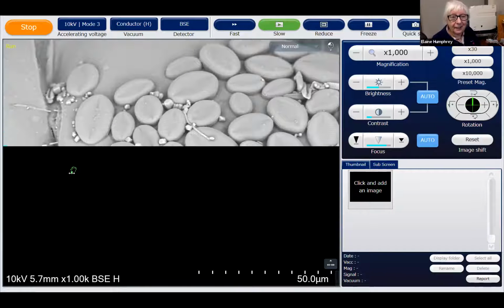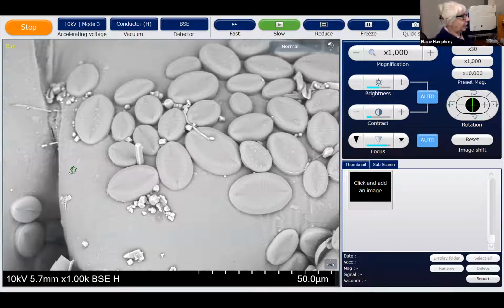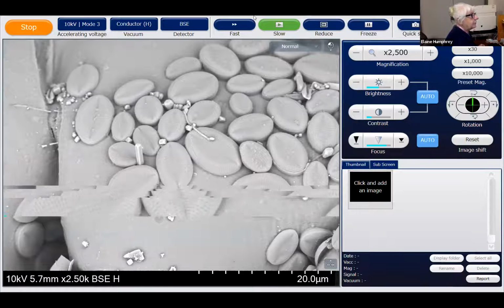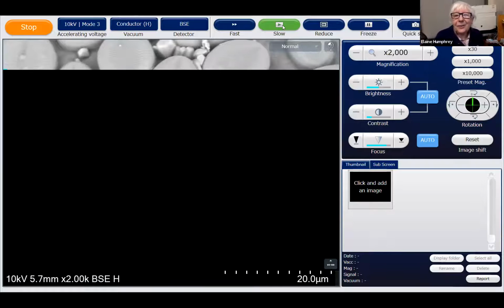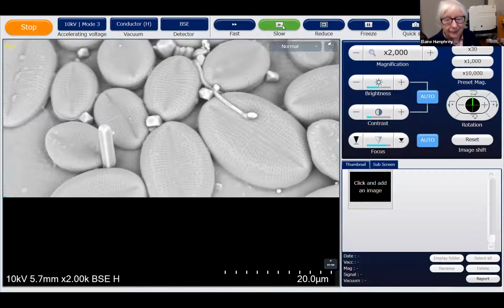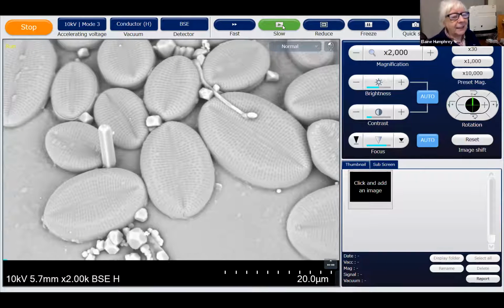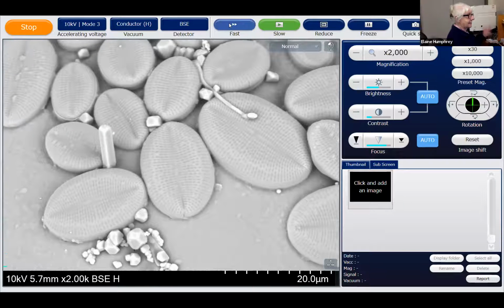So the salt dried down as well and it crystallized. And if you've been in seawater, you know it tastes salty. Salt is sodium chloride, sodium and chlorine. And sodium chloride crystals are little cubes, but nobody told this one it was supposed to be a cube. And this one down here, let me just make him a bit bigger. This one down here is like a dodecahedron dice that the kids use on board games. So that tells you there's a lot more in seawater than just sodium and chlorine. There's magnesium and calcium and there's carbonates and sulfates and chlorides, and there's so much in seawater. So the crystals aren't going to work as they would if it was a pure chemical. Not mixture, this is a mixture.